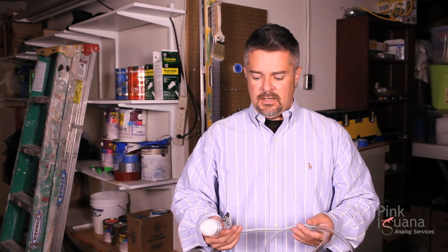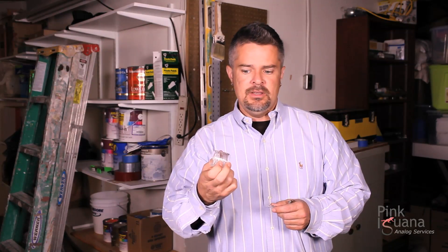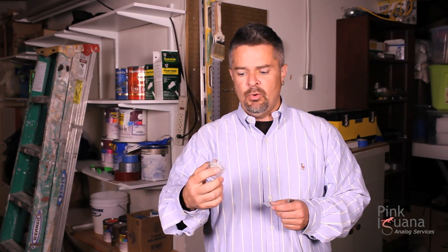Lastly, what we have is the filter. This is the filter that is placed at the end of the hose that the air is drawn through, right by your employee's breathing zone. Any contaminants are captured on it. At the end of the day or at the end of the air quality monitoring session, this is FedExed to a lab. The lab analyzes it and reports to you exactly how much lead was in your employee's breathing zone over that specific period of time.